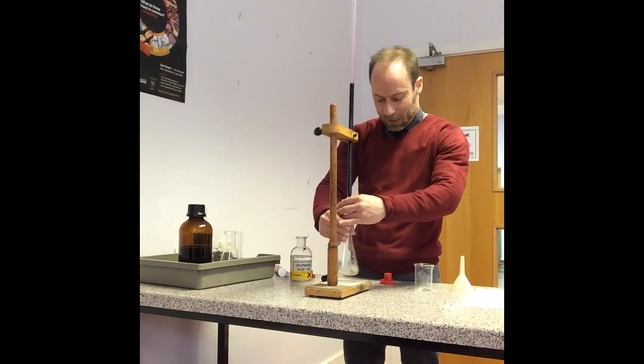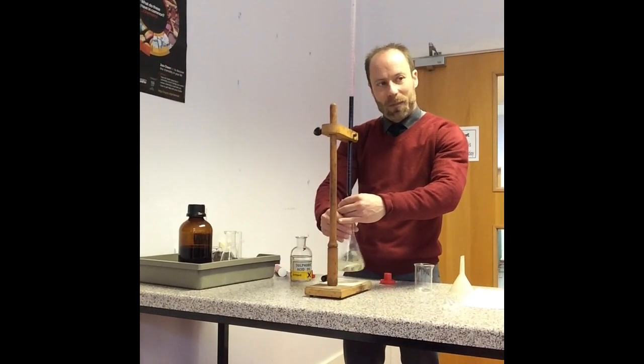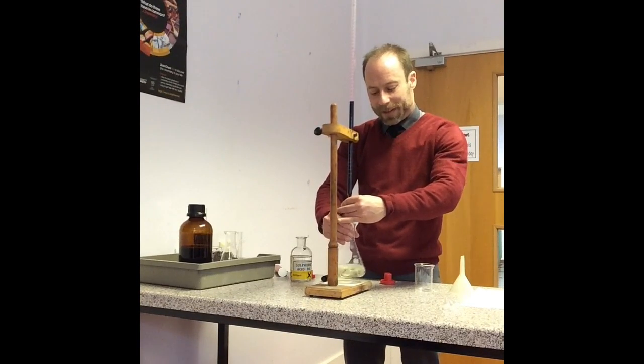Why is there such a sudden end? I know because of the graph. Yeah, it's your acid base, your acid alkali titration. You get a sudden shift in pH. Which means that your indicator, because your indicator is generally a weak acid, the protonated form of your weak acid is a different colour to the unprotonated form. And so because you get a sudden change in pH, it suddenly shifts it to the other colour. Not for this so much, because this is a redox one.